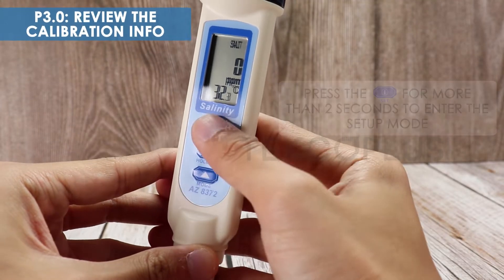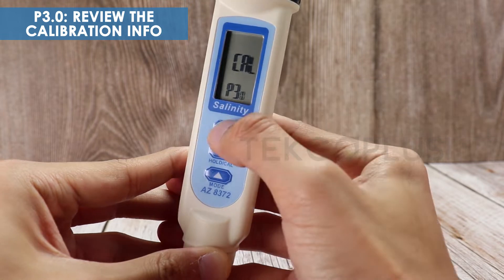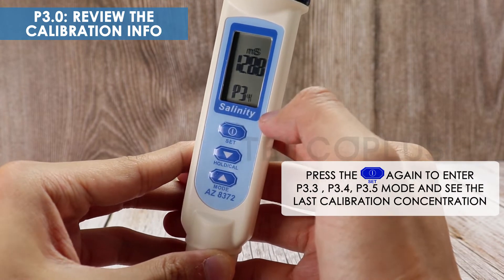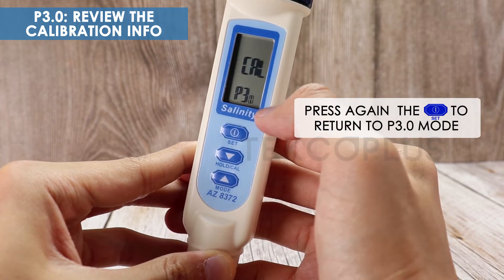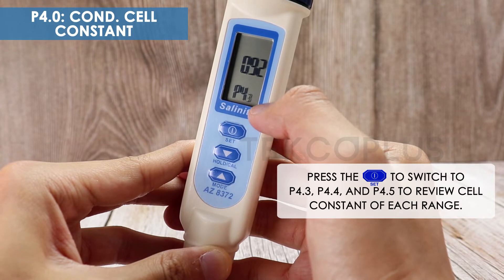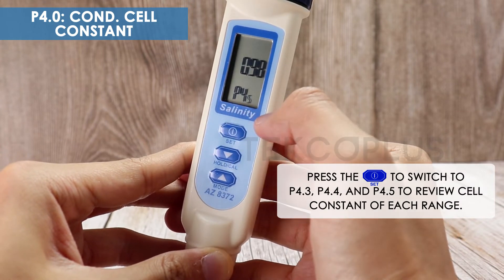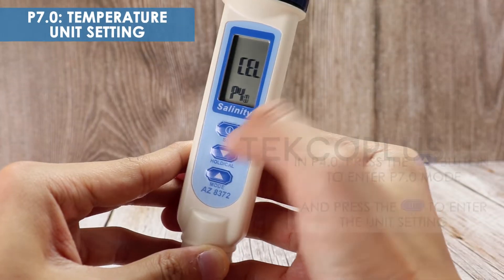Reviewing the calibration info: COND cell constant and temperature unit setting.